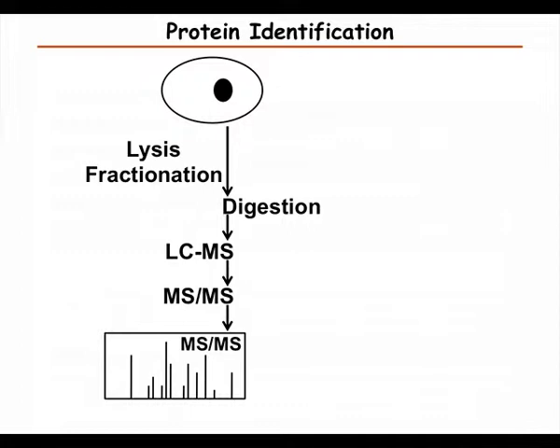So as we looked at before, one aspect that we have to do in data analysis is to identify the proteins that are in our sample, and the idea there is to try to use the data so that we can identify as many as possible without getting a lot of just random matching. And so what we do practically is that we try to mimic the experiment. So in the experiment we first prepare our sample, digest the proteins, and then separate the peptides, and then measure lots of MSMS spectra.